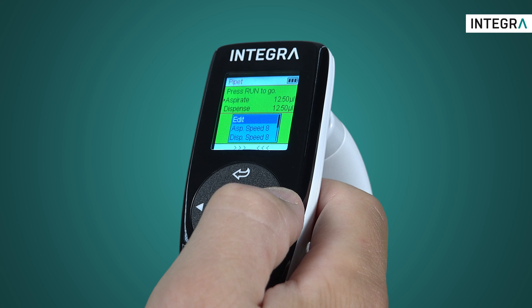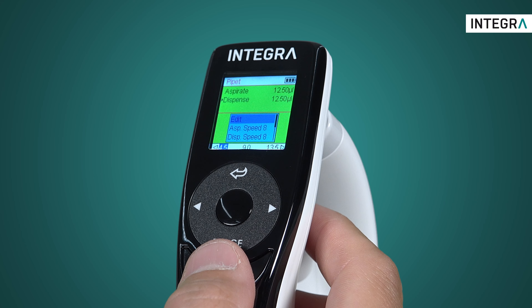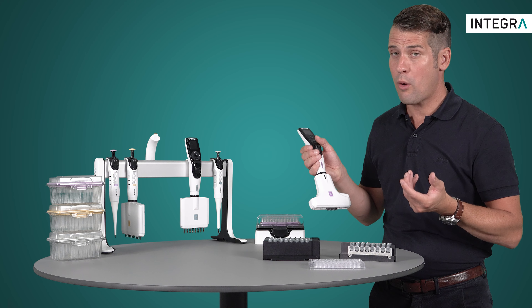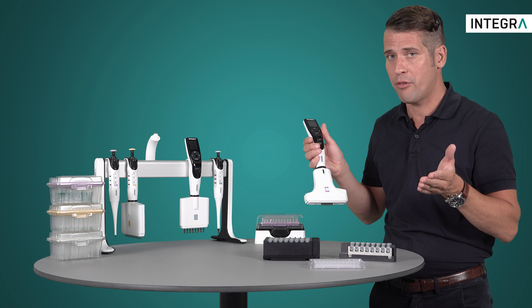You'll operate this pipette just like any other ViaFlow electronic pipette with the added functionality of tip spacing. There's another way to do this, which requires you to only press the Run button for all the actions which the pipette performs.